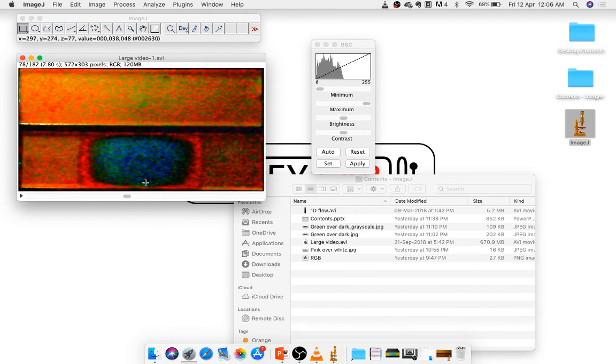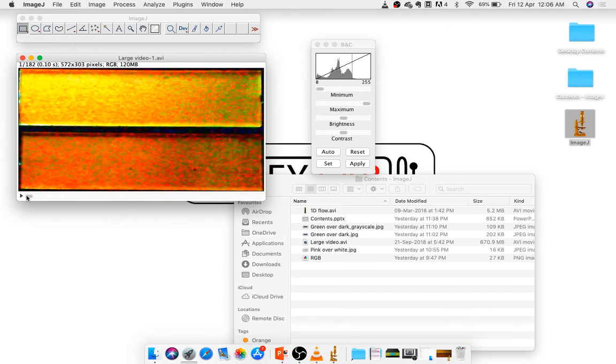Okay, I'm going to pause that. Now the next thing is, when I want to show this in a PowerPoint presentation, I want to have a timestamp, because if you don't put a timestamp, they're going to ask you, hey, how long is this video? Is this an hour? Is this a minute? Here you see that this is 182 frames. Now, when you capture this in Handy AVI, you know that a frame has been captured every so many seconds. So let's say in this case, a frame has been captured every second.